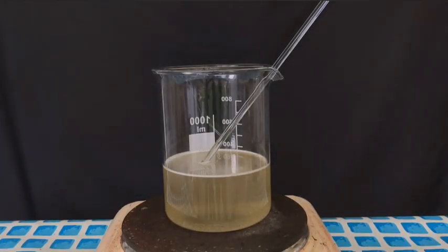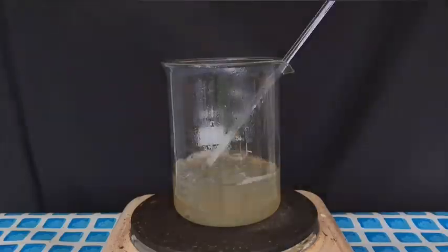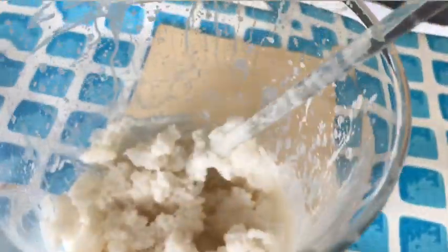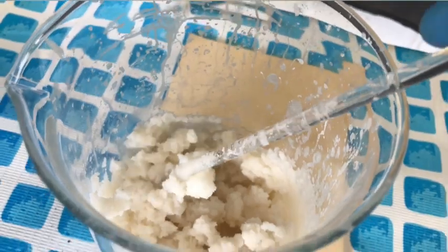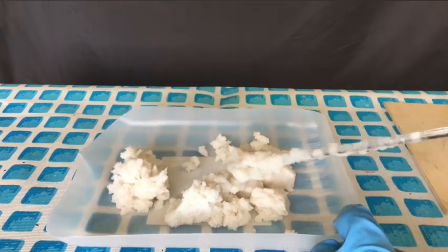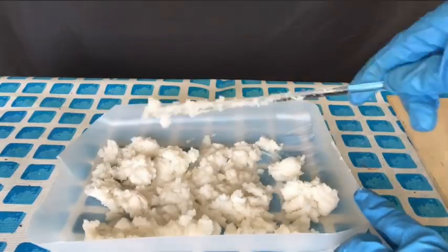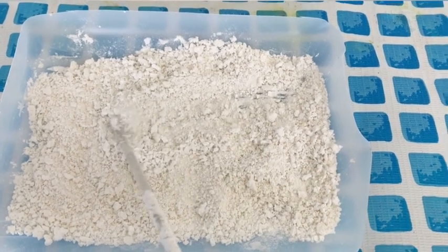After a while you were able to see some white flocks of calcium acetate starting to precipitate. After boiling off most of the water we were left with this. We didn't heat it up until it was completely dry because we don't want it to decompose into acetone. It was then transferred to a plastic tray, spread out nicely to increase its surface area and speed up the drying process. After only a few days we were left with this bone dry calcium acetate powder.